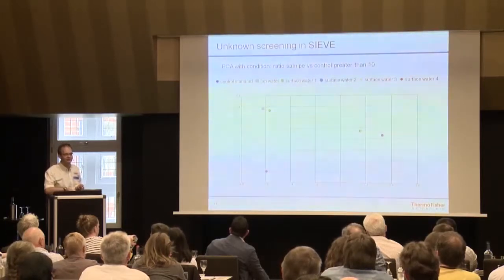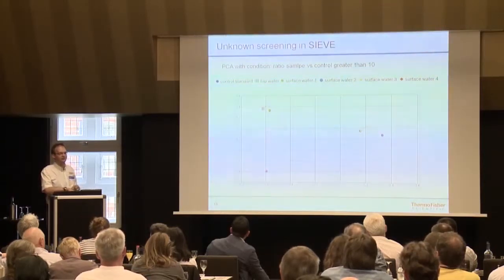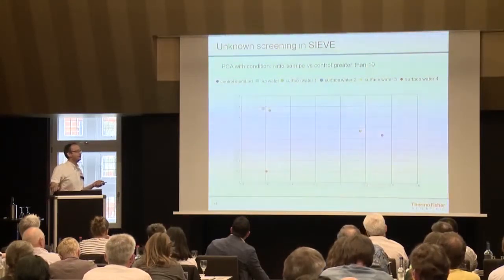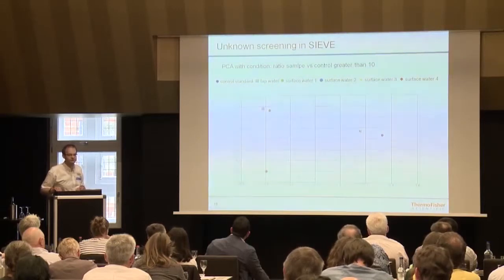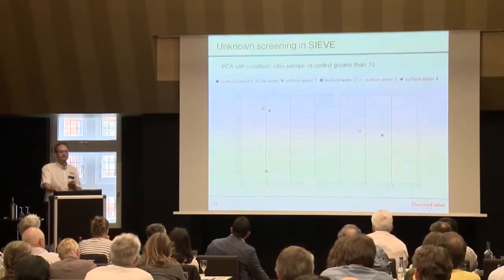You more or less can drink it, obviously. This is the one which is coming out of the wastewater treatment plant. It's rather dirty. And here, these are the mixtures. And so this whole picture makes a lot of sense. Of course, we can say now, yes, easily to explain. We know what's behind it. But for me, it shows that such a PCA analysis makes a lot of sense.